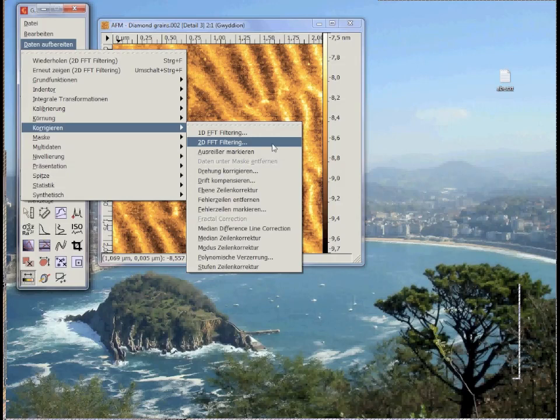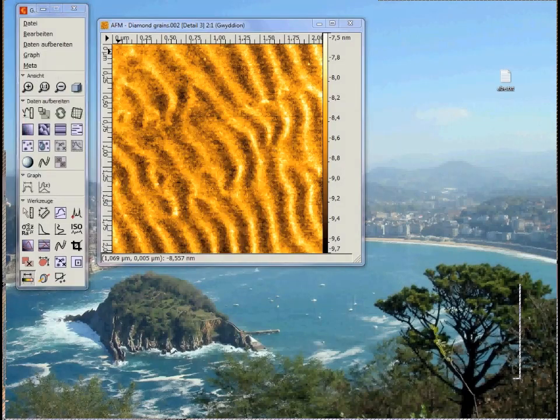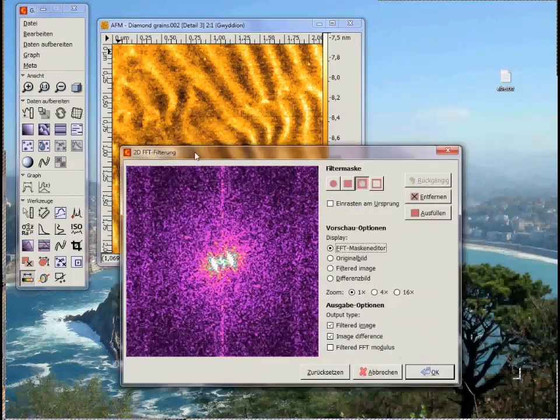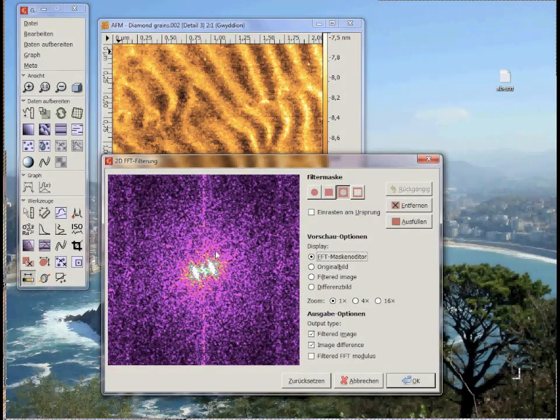The mathematical procedure is: your image is Fourier transformed. You select some areas from the transform which will be transformed back. This is done by clicking here, Data, Corrections, 2D Fast Fourier Transformation Filtering. Now in the new window you can define areas from the transform which you want to filter.